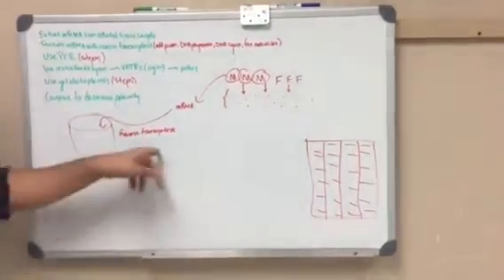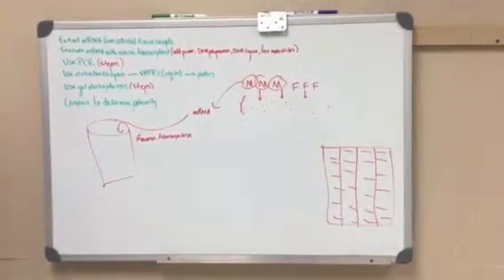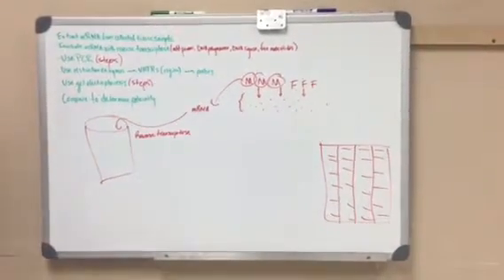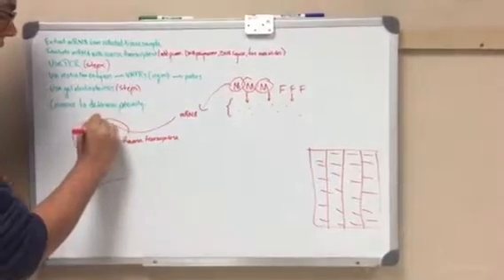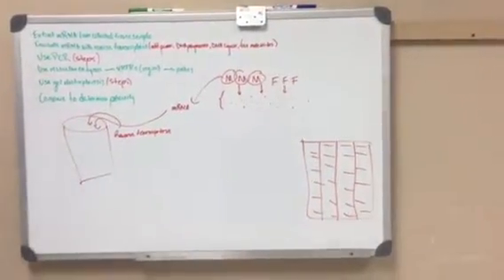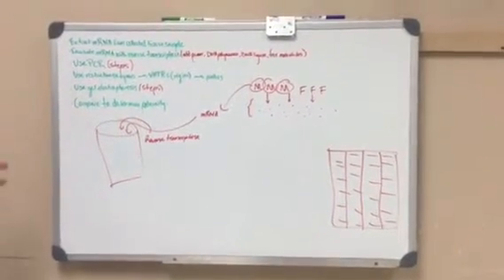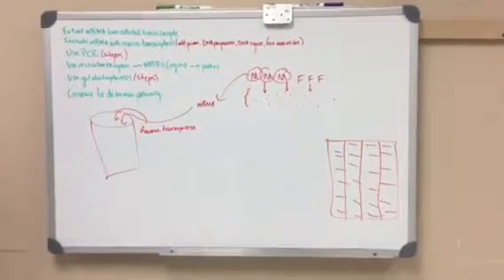which basically does what its name says. It does the opposite of transcription. So it'll make a single-stranded molecule of DNA. So we're going to also put that inside the buffer solution, and now we have mRNA and reverse transcriptase. So what we're going to do is a process to get double-stranded DNA. That's our end goal in this process.